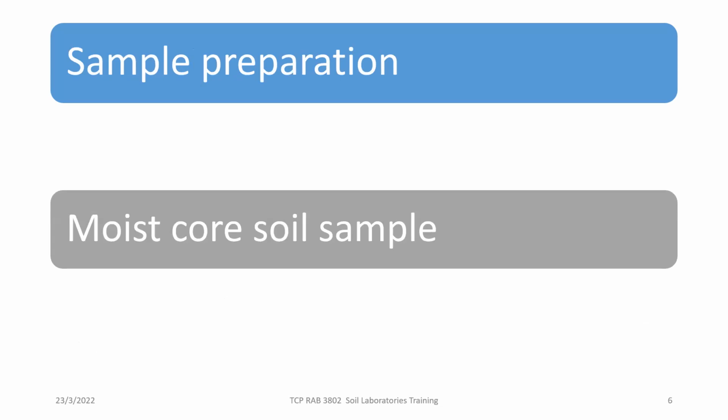The sample here is just a moist core soil sample, and this methodology can be done, or the soil preparation starts, from the field.